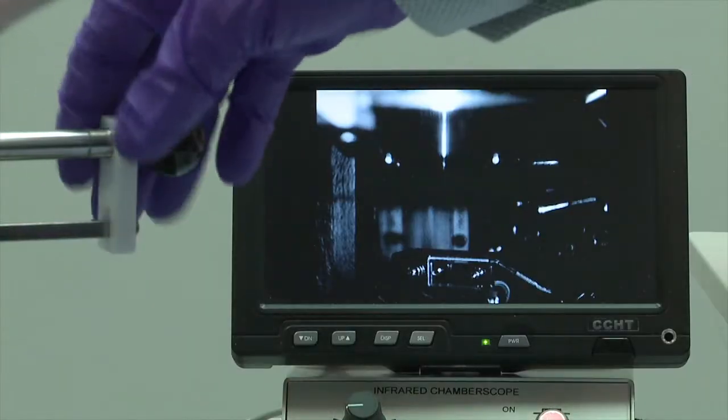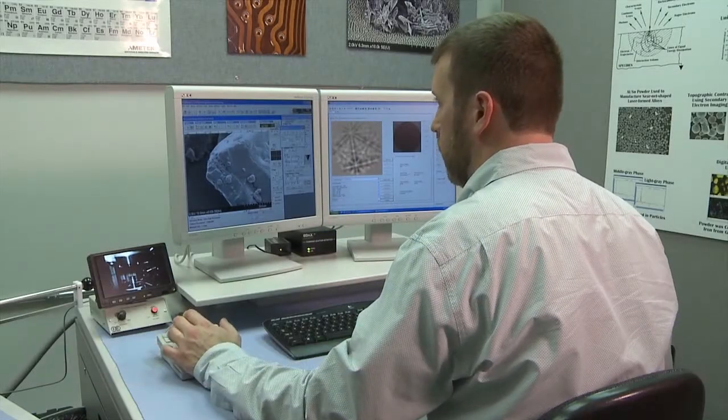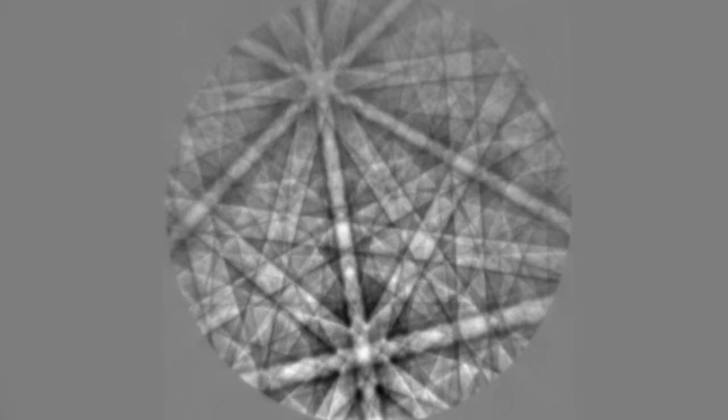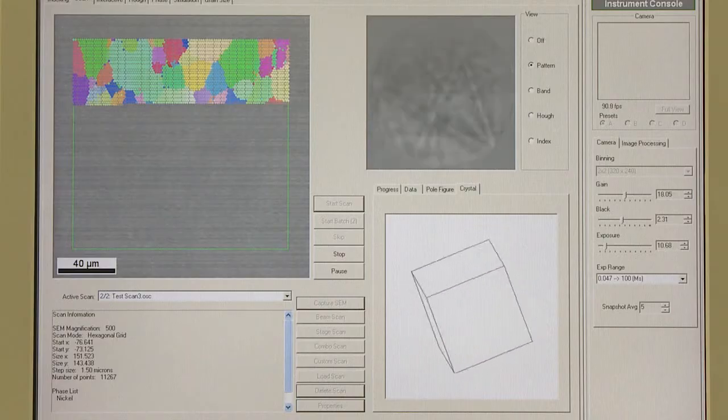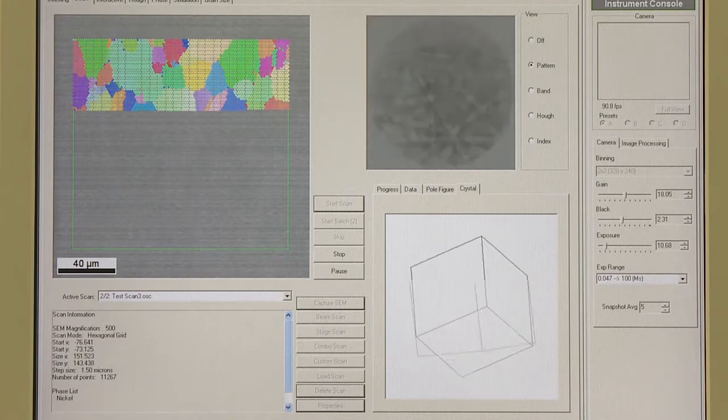Another SEM tool involves the use of electron backscattered diffraction. EBSD provides information about the crystal structure, that is, the arrangement of atoms within a material. This is important because that specific arrangement determines a wide range of material properties, such as strength, toughness, or hardness.